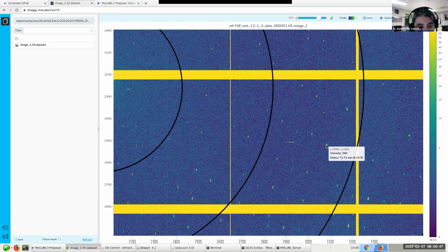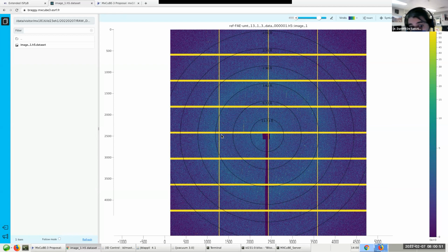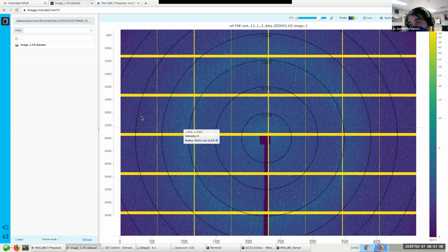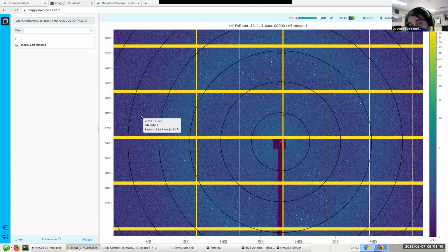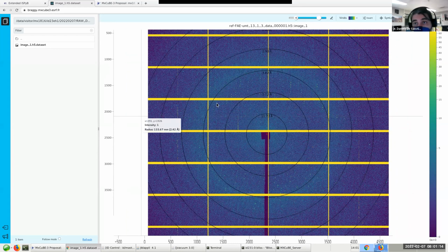Of course, this is intended to provide you with a tool that you can use remotely to look at the images, which is a bit more advanced than just looking at the JPEGs that are stored in EXI, and without the need to use a different image viewer that will have to run through NX or through Guacamole in order to visualize the images.